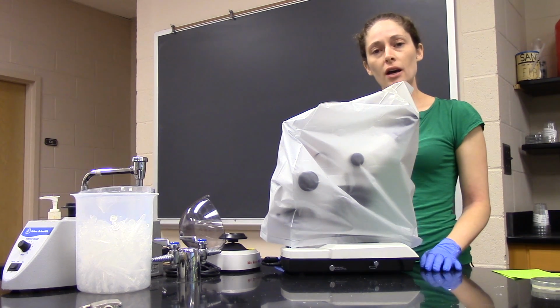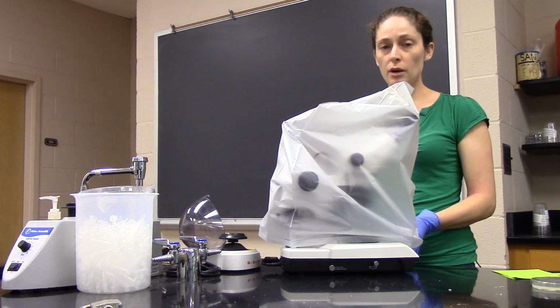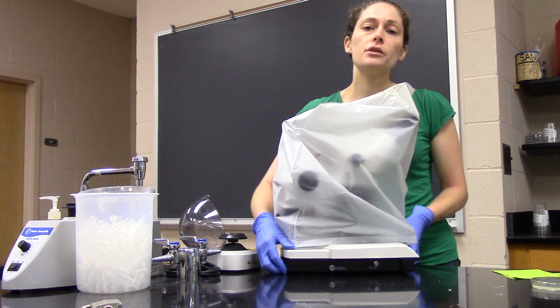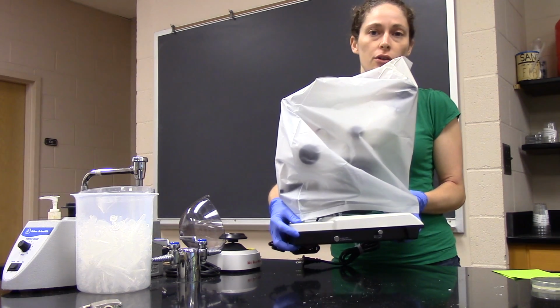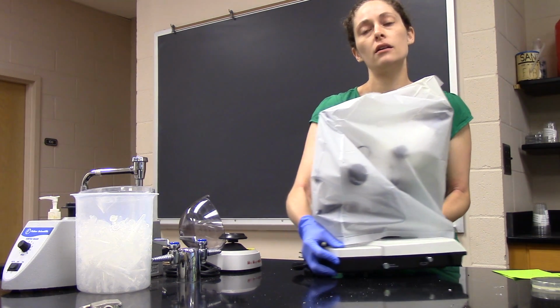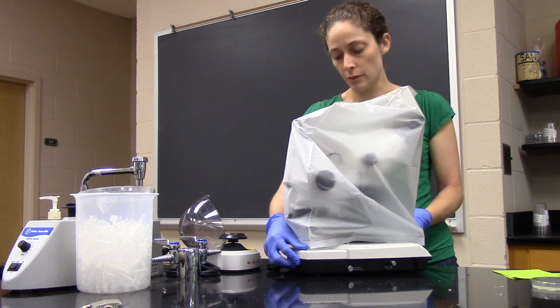Okay, so let's talk about how to use the dissecting microscope. When you get the dissecting microscope, if you need to get it out of the cabinet or move it along the bench, you always want to grab it from the base, okay, and put it exactly where you want it. Don't slide it along the bench. Those vibrations as you slide could harm the inner components of the microscope.